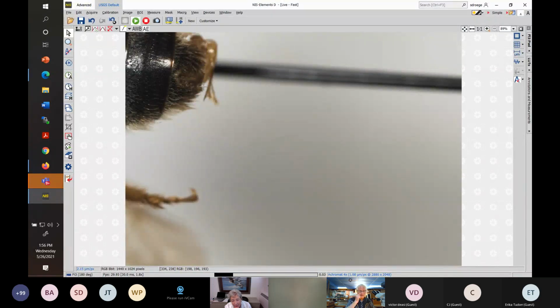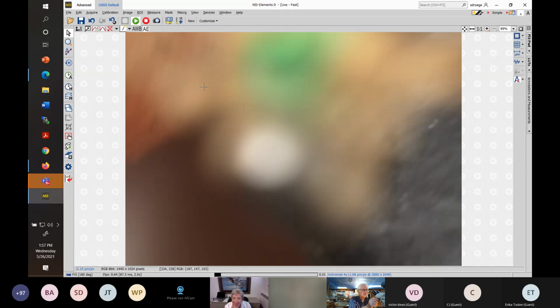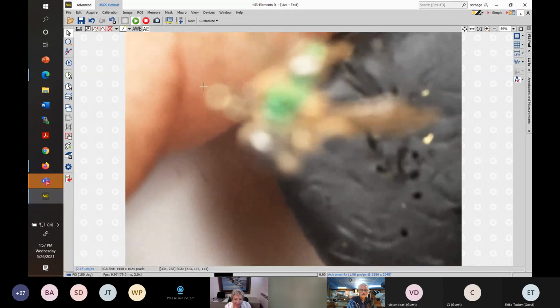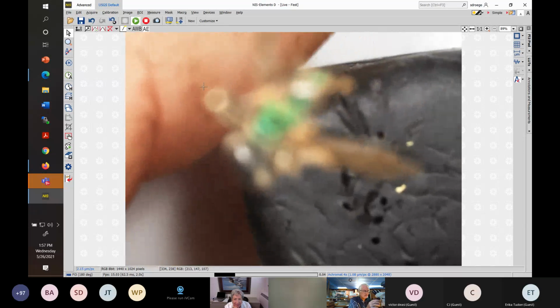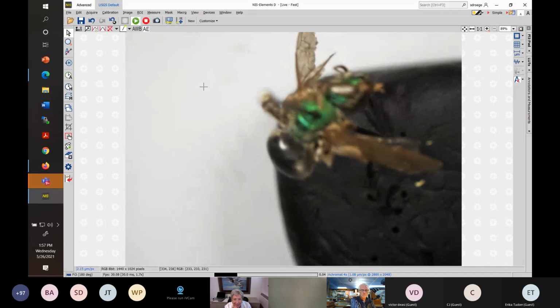So I'm going to stop. As you can see, there's lots to think about and learn when you're dealing with an entire group of creatures that are not part of our day-to-day civilization understanding of how bees work.